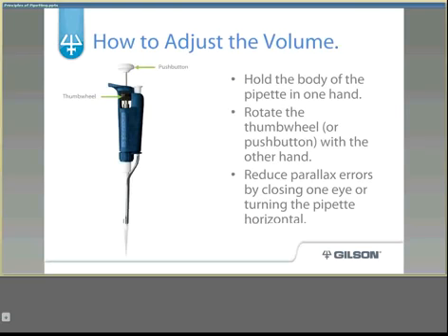You can adjust the volume with the push button and thumb wheel for newer models, or with the thumb wheel alone for older versions. Hold the body of the pipette in one hand and rotate the thumb wheel or push button with the other. To reduce parallax errors, either close one eye or turn the pipette horizontal.